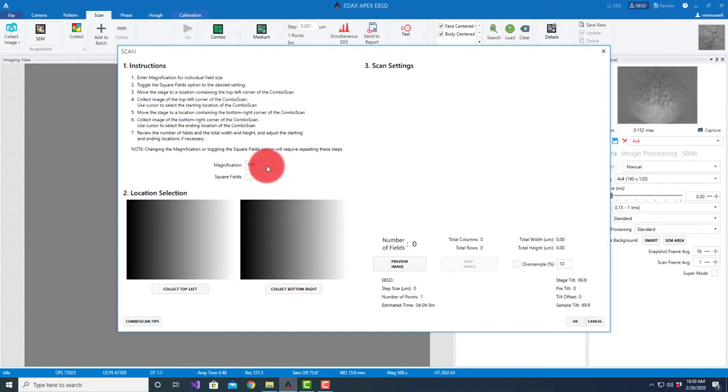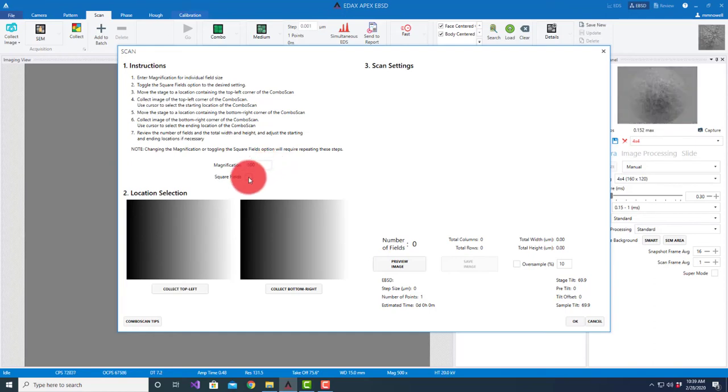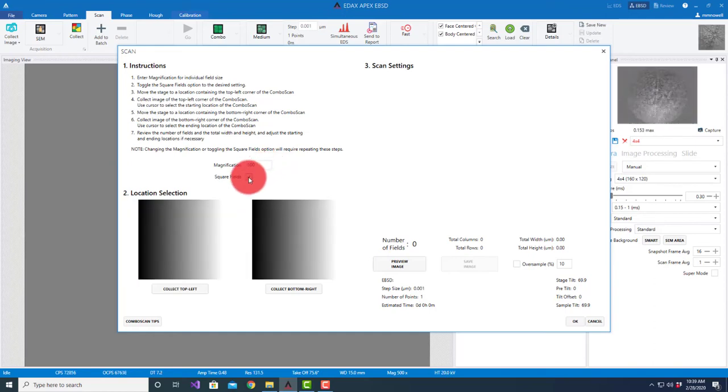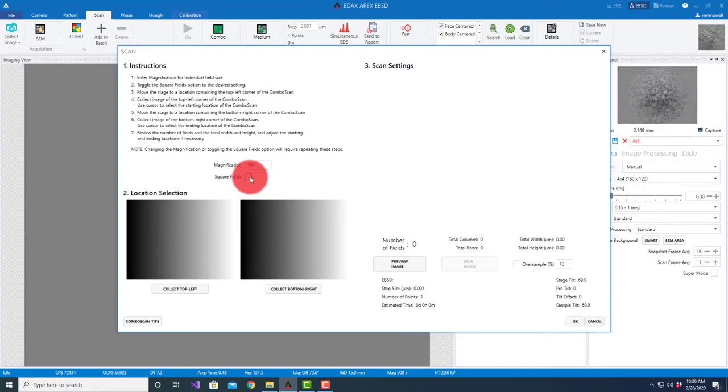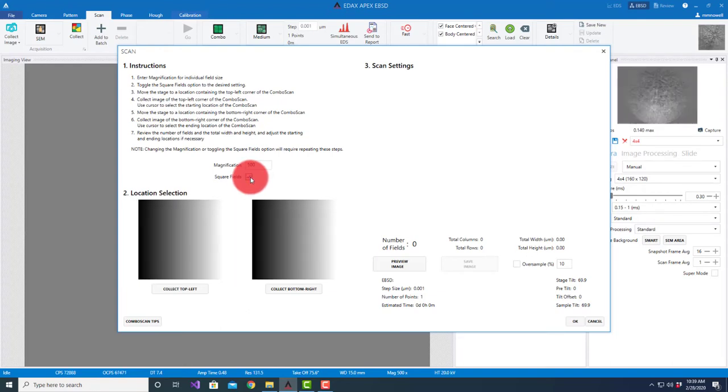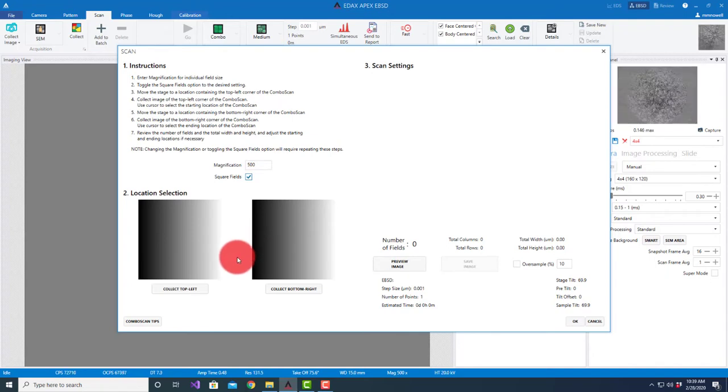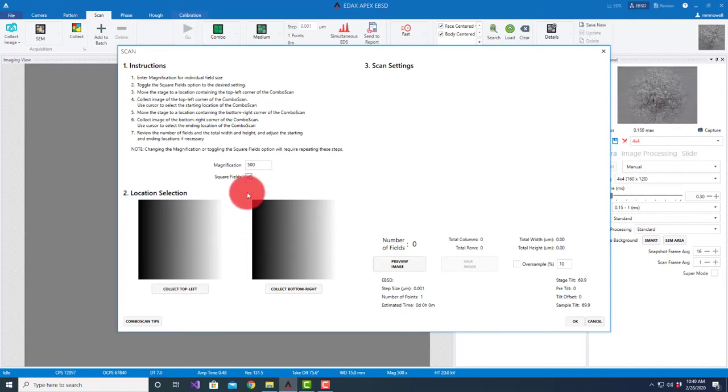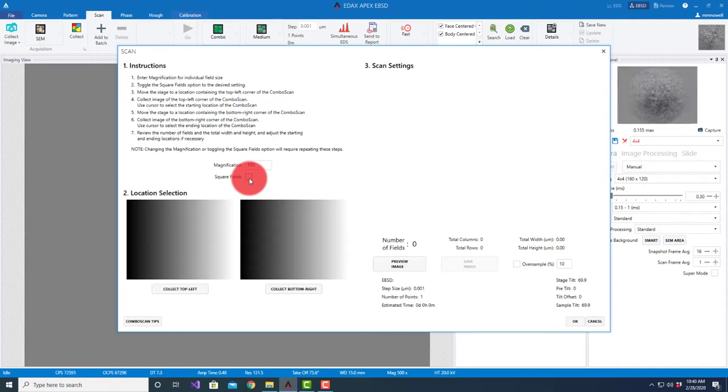I'm going to set it up at 500x magnification. We have the option of looking at square fields - you'll see here that reduces these to squares - or we can look at the full rectangle. The idea of square fields is that we're not deflecting the beam quite as much, so we might get a little bit less distortion and it might stitch a little bit better.